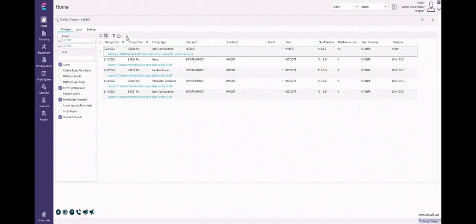And what's good about that is the change that you made under revert will track all the information, so you can be sure to have a good audit trail. Okay, let's go on to the Locks tab.